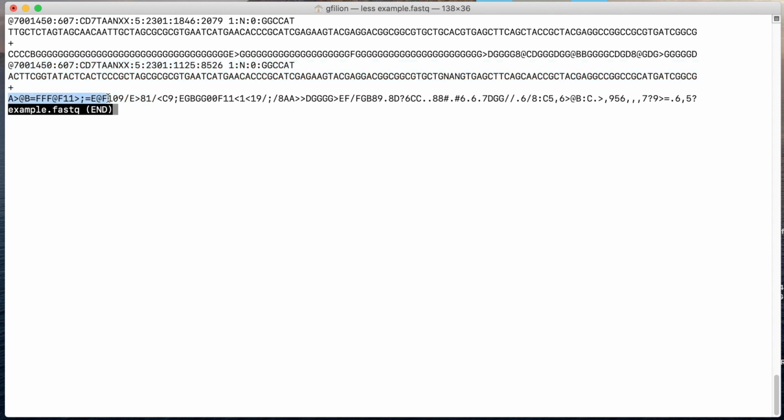The letters that correspond here to the decoded nucleotides are very weird symbols that really correspond to a lower quality score on the phred scale here. So this just says that the confidence that the sequence is actually this one here, in the case of the first read, is substantially higher than the confidence that the sequence is this one for the second read.